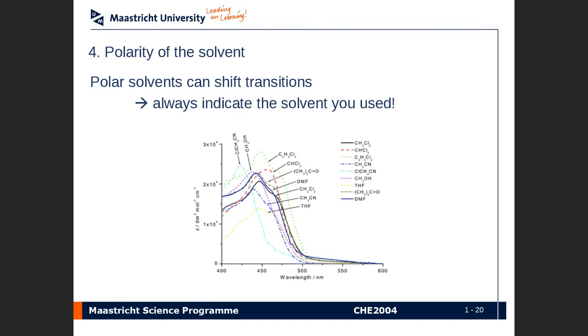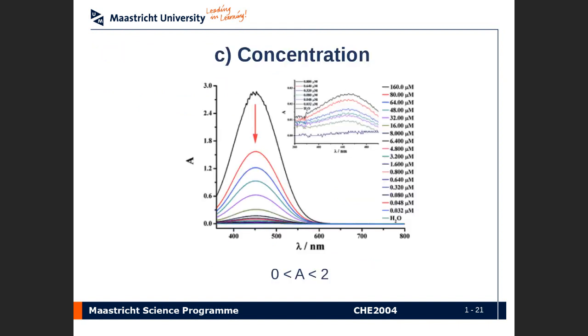So what I was saying was the important thing is also that the concentration is very important. Okay, so we've seen that the solvent affects the relative shift of the band positions, but so does concentration. And this is obvious from the Beer-Lambert law. The higher the concentration, the higher the absorption. You see on the y-axis we have absorption. Obviously, lowering the concentration lowers the absorption.